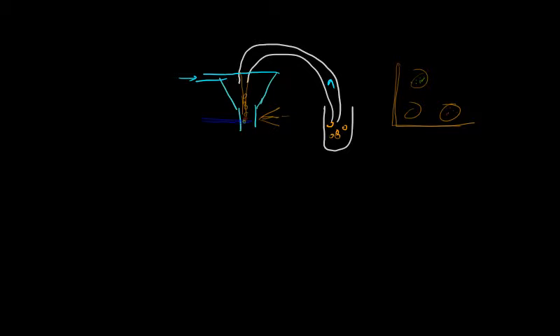So as the cells are crossing the laser here, they travel through and go to the waste. If you are not sorting, then there is a waste cup, so it takes the sample into the waste. Basically the cells form a stream, and I'm talking about a stream in air. So it's called stream in air. That means a stream is generated and it comes into the air. Most of the high speed sorters are actually stream in air based sorters.